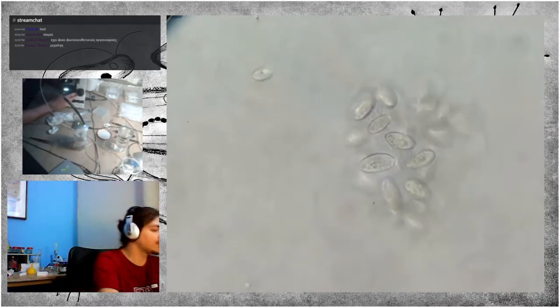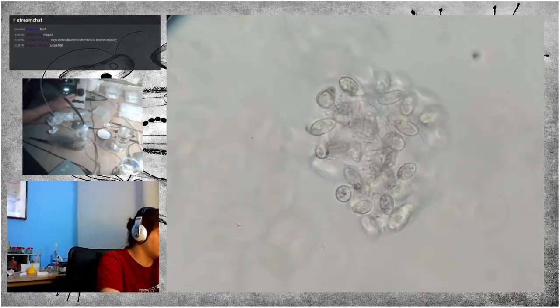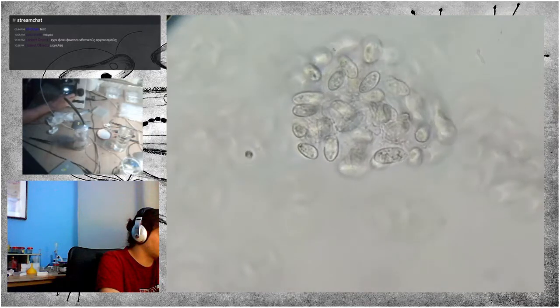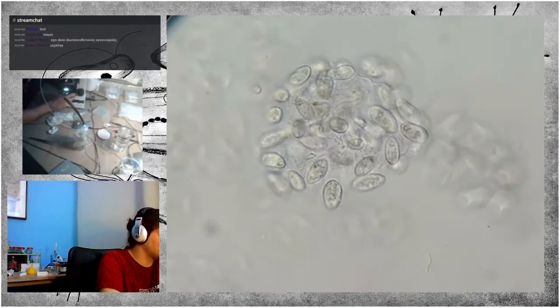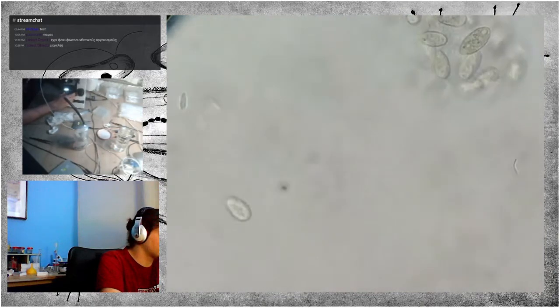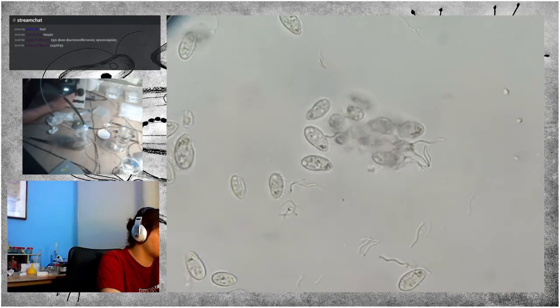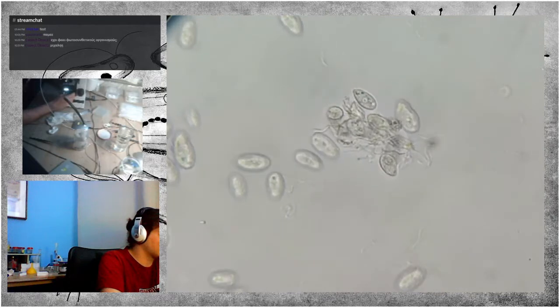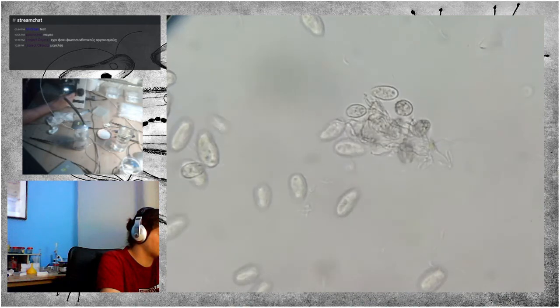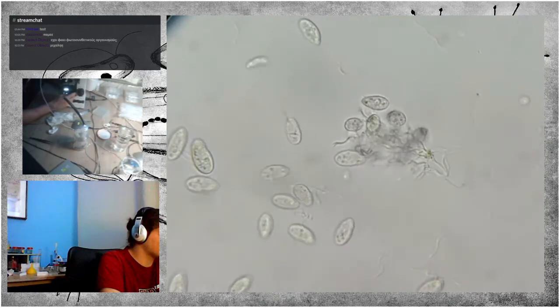They form a ball, at least a spherical structure, which the ciliates stick on, and they slowly go towards the center. I'm not sure though. But the concentration here is another one, smaller. I think the ciliates are getting either stuck or being consumed by the bacteria, which is very interesting if that's true.